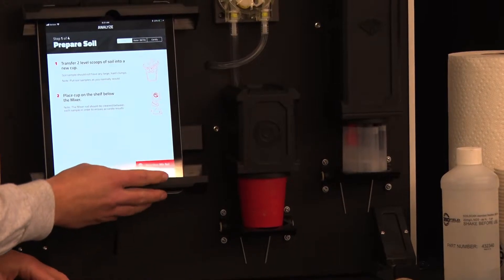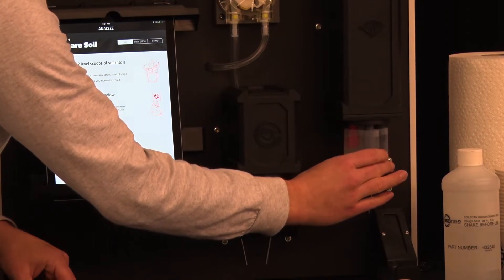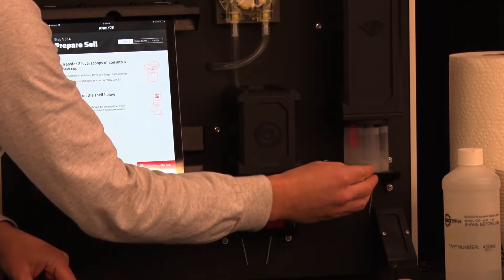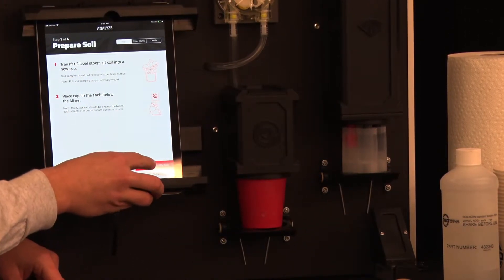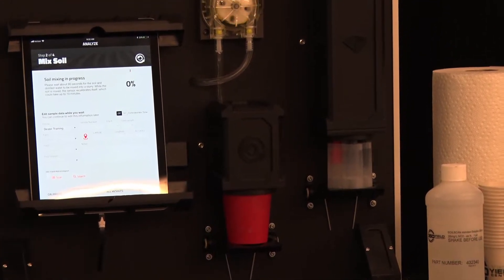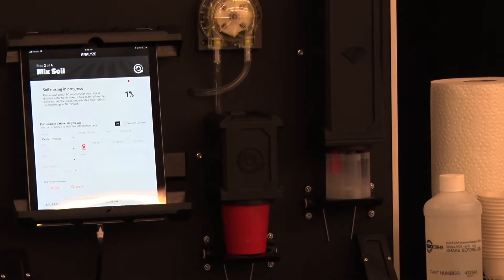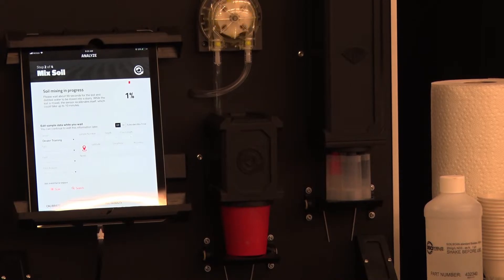Then you'll select next step mix soil. During this step you want to ensure that you leave your sensors in the nitrate solution in the calibration bottle. While the soil is being mixed the sensors will calibrate again. At this time you can go ahead and start entering your data.